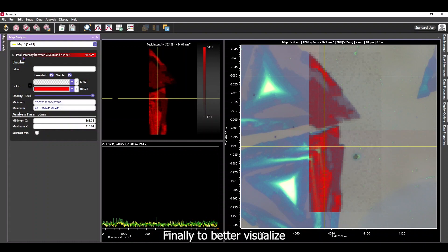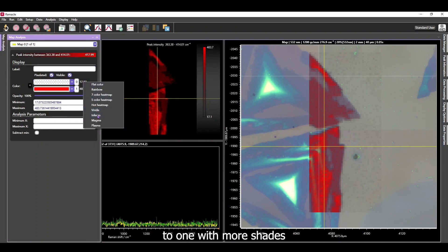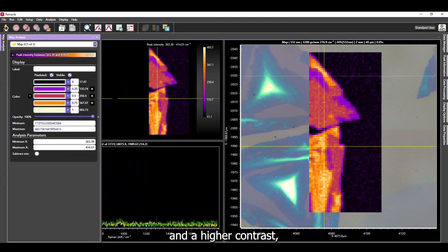Finally, to better visualize the multi-layered effects, we can change the color scheme of the map to one with more shades and a higher contrast, of which there are multiple built in.